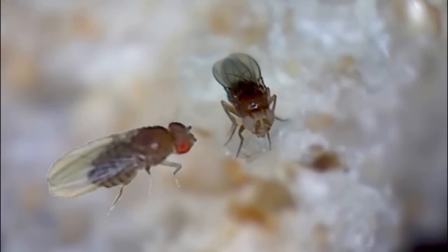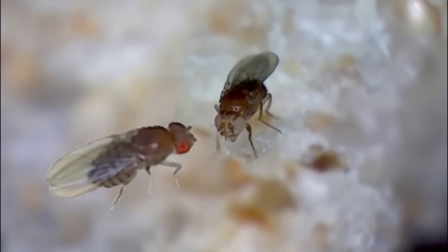Basically, the experiment you will undertake involves mating white-eyed and red-eyed fruit flies and observing the eye color of their offspring.